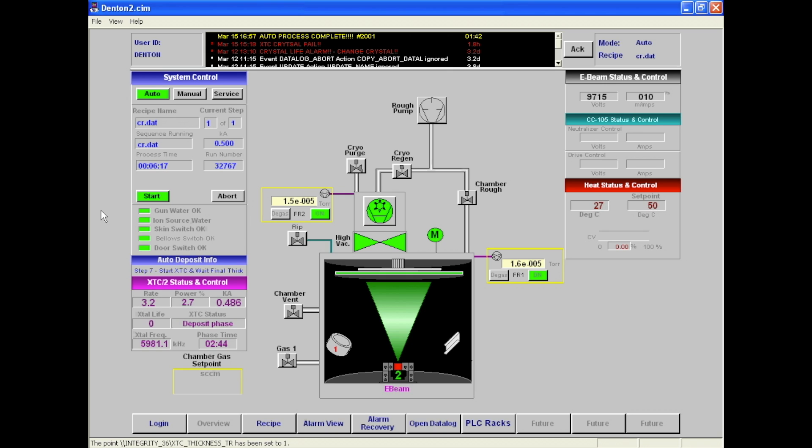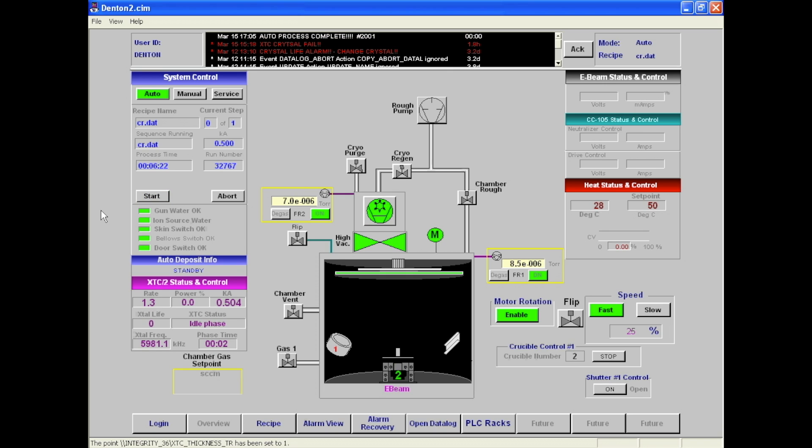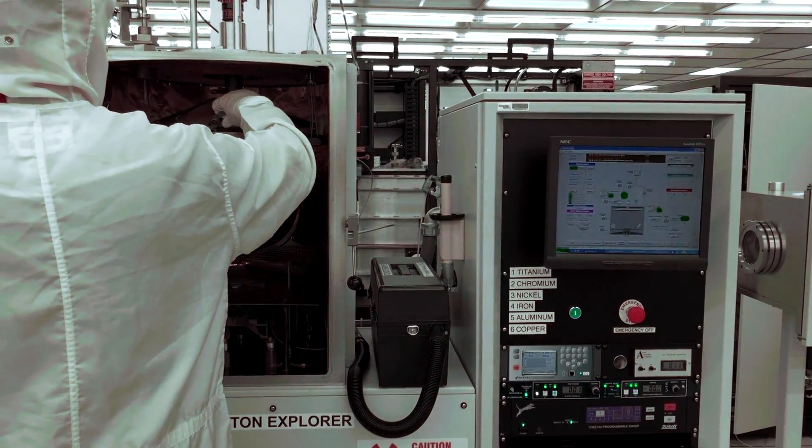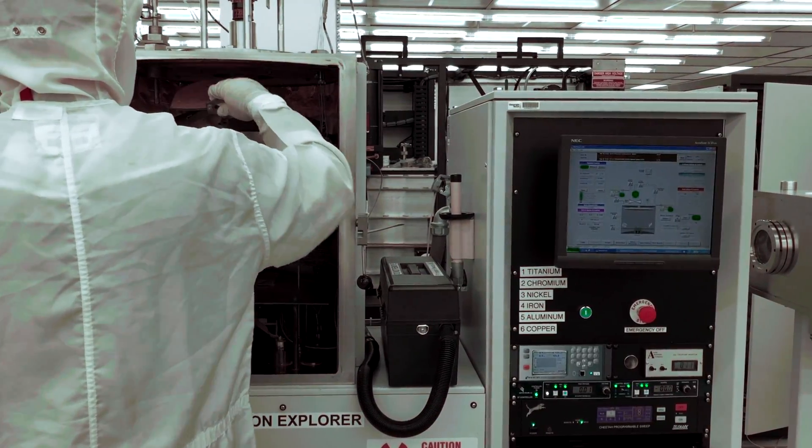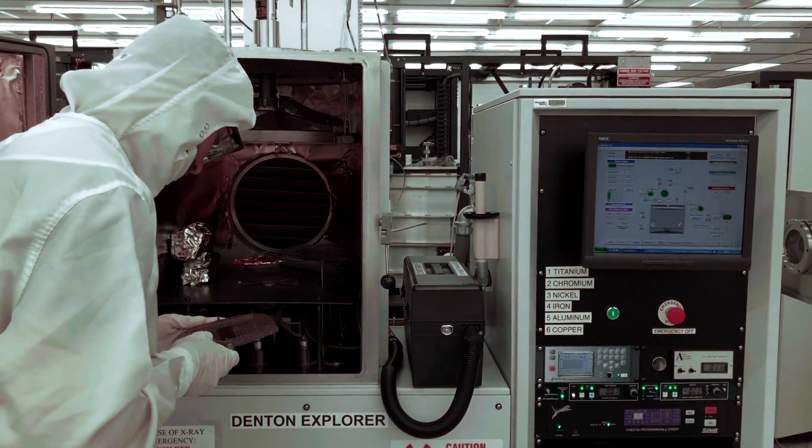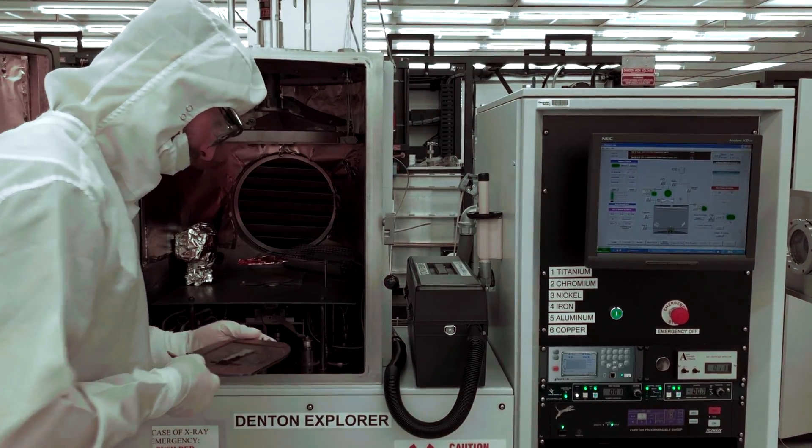After the process is done, make sure to allow the system to cool down for 10 minutes before venting the chamber. After waiting, vent the chamber by loading the recipe and then carefully removing your sample.